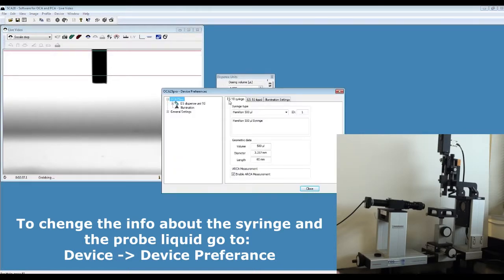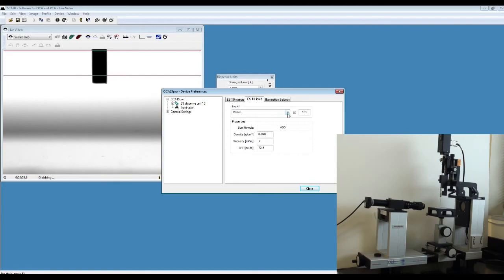Here, on the ES10 Syringe tab, you can change the syringe information. If you are using a different syringe, say Hamilton 1000 microliter, or a different probe liquid, you can change that information on the ES10 Liquid tab.